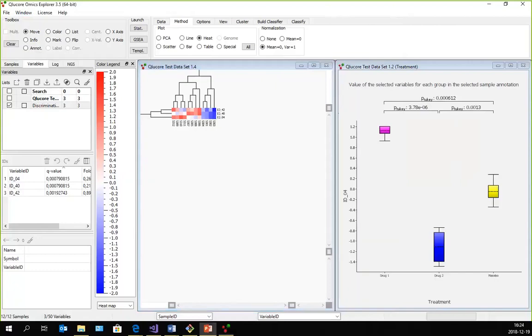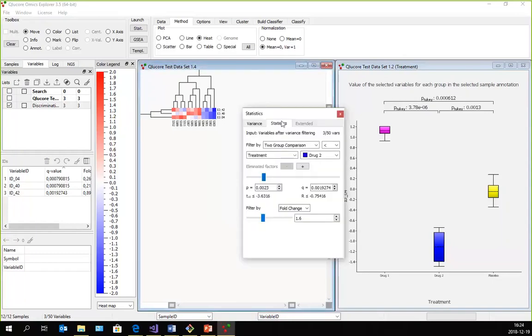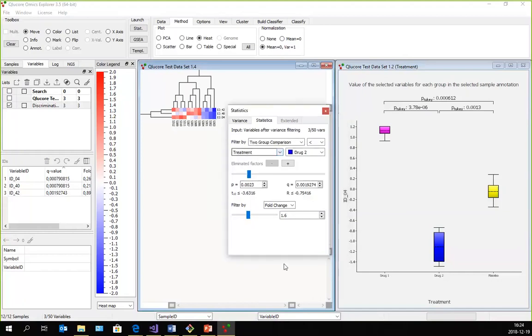Yeah, it's here on my other screen somewhere. Let me see. There we go. It was located on my other screen, I think. Wait a second. I have so many windows. Here it is. It's behind a lot of other windows that place themselves on top of it. So the statistics window was brought up as well, but ended up on my different screen here.